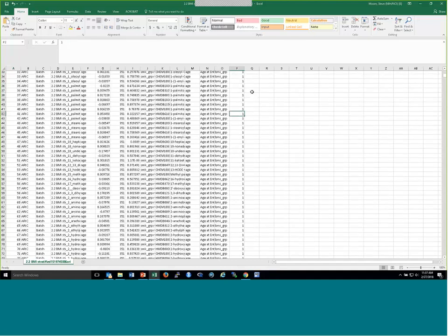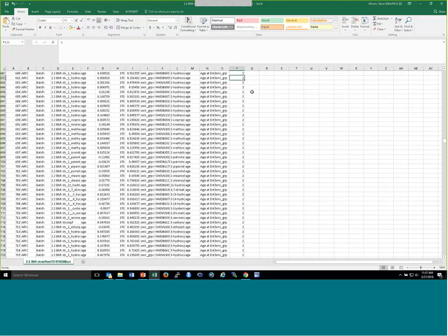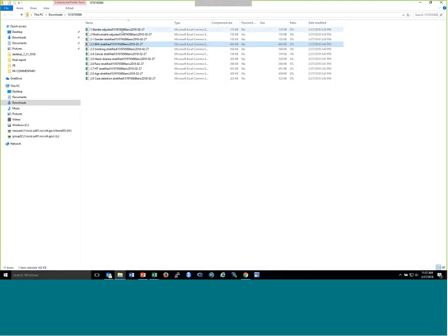And if you go all the way down, you'll see that after about 611 metabolites, you're on to the next BMI group. So this is essentially all of the metabolites run against age within strata of BMI. And there's similar findings in all of these other different models.